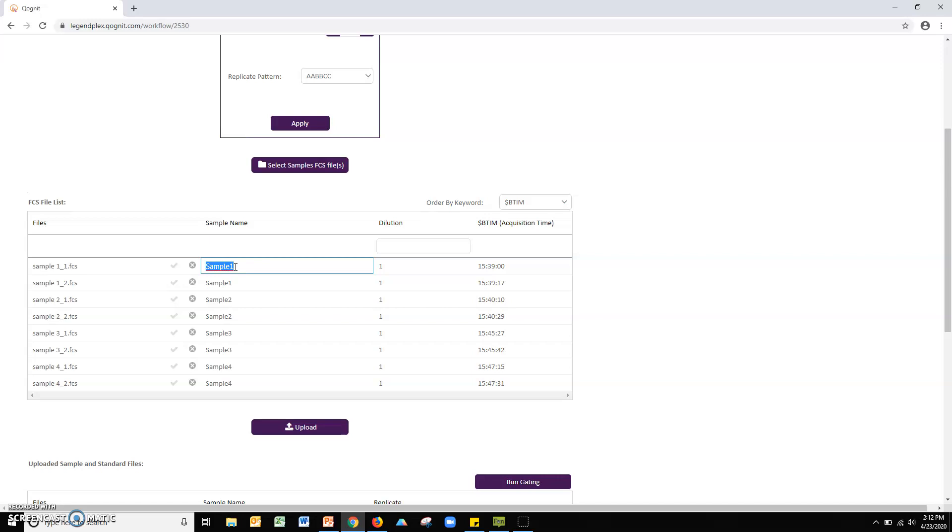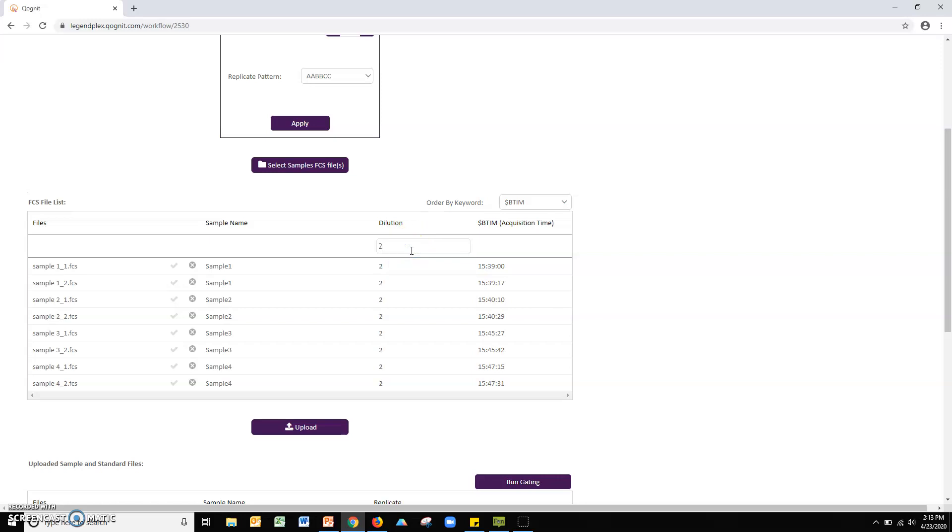Next, please input any sample dilution factors. You can manually enter values for each file in the dilutions column. Alternatively, you can apply a global dilution factor to all samples by entering a value into the dilution box. Click the upload button, which is found below the sample files list.